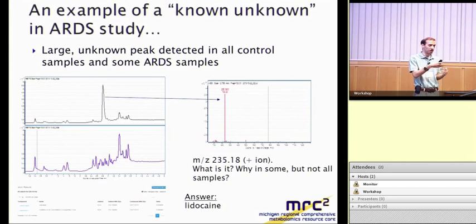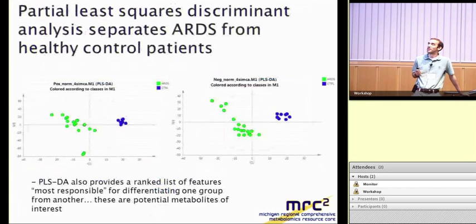Additional features, feature discrimination and in-depth analysis will tell you whether it's really real and promising, or whether it looks like it's a fragment of something else, or whether it's just chemical noise. And that does happen occasionally too. Okay, so known unknowns. That's sort of my summary there.